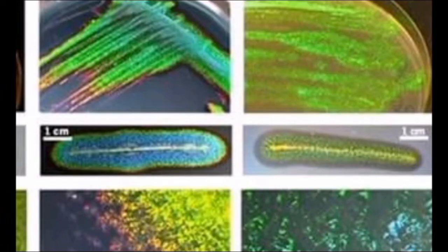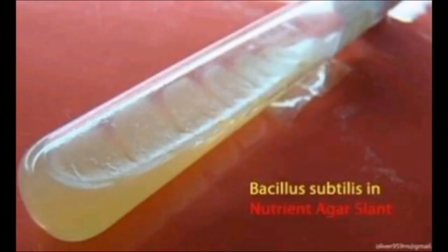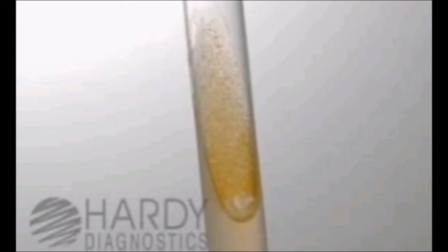They're from the deep water organisms. And here's an example of an iridescent bacteria, although there isn't one in an agar slant. In the category form, there's a filiform growth pattern, an echinulate growth pattern, which is an example is E. coli and Aliivibrio fischeri. There's the beaded pattern. An example of this is the Bacillus subtilis. A effuse pattern. An example of this is a Mycobacterium tuberculosis.